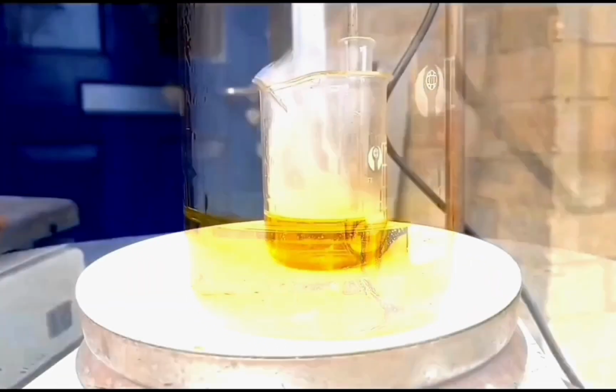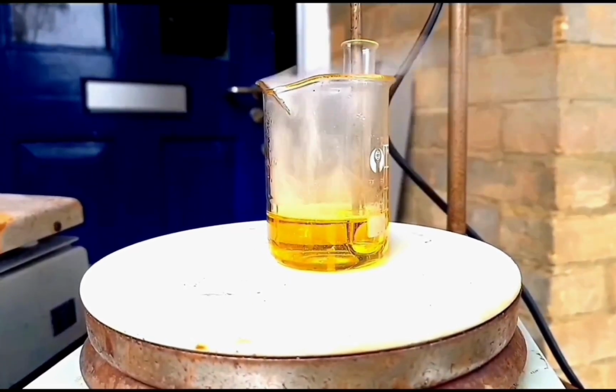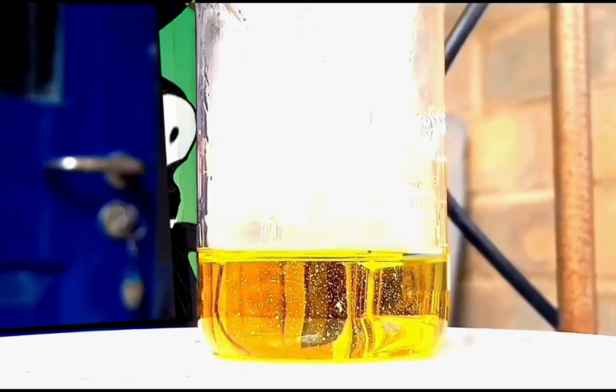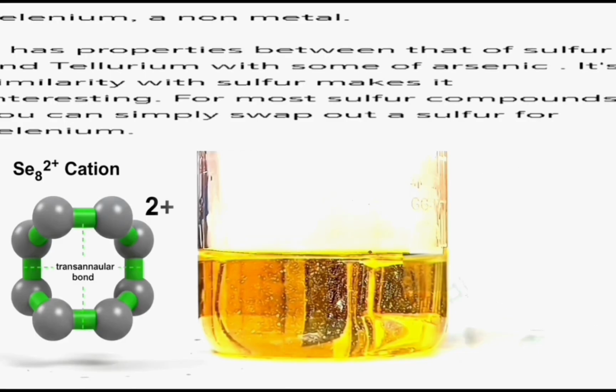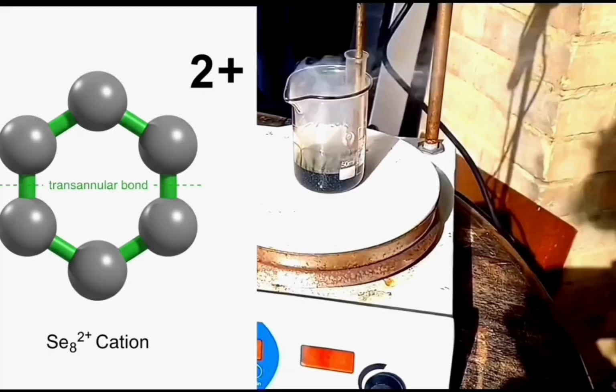but it can be dissolved using hot concentrated sulfuric acid. It is less stable in sulfuric acid. It is easily reduced and not so easily oxidized. It forms polyatomic cations that give interesting colors. You will often see a green solution at first, which turns yellow as it oxidizes further.